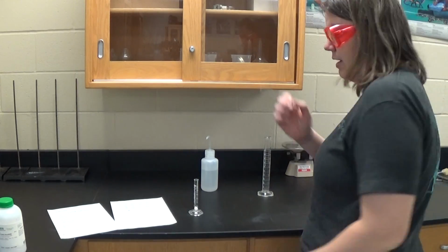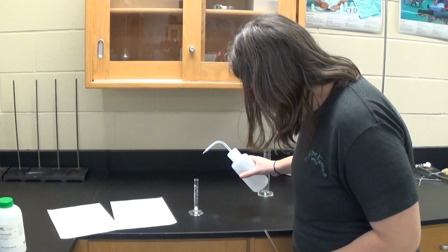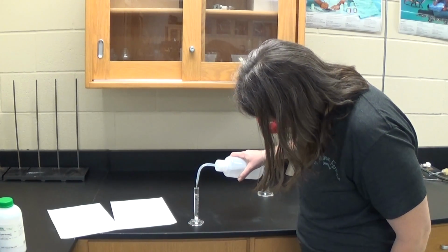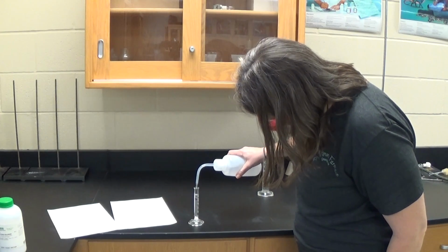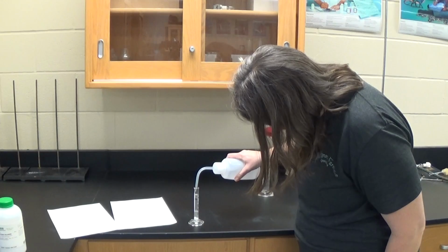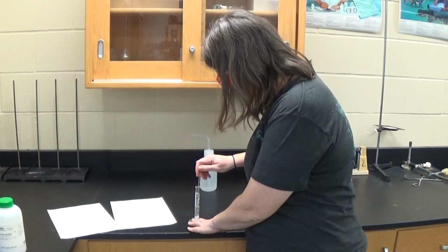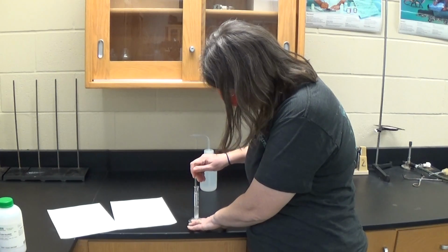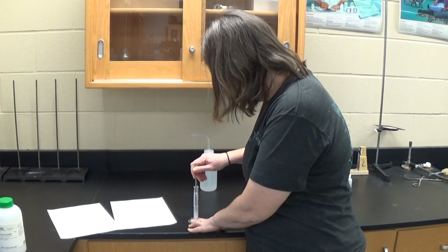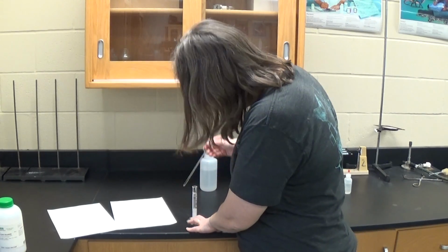Sorry about that. So I have my stirring rod, so I'm going to add enough water to get to the 5 milliliter mark. So there we are to the 5 milliliter mark, and it tells me to stir. So there, I've stirred it all up down to the bottom.